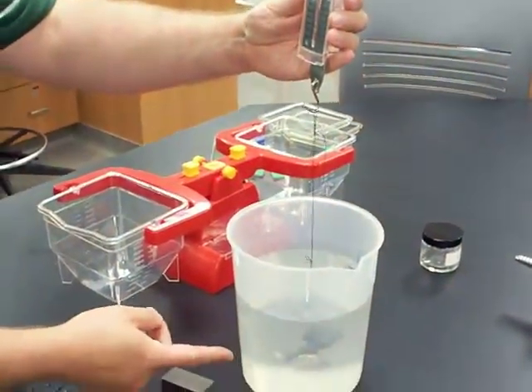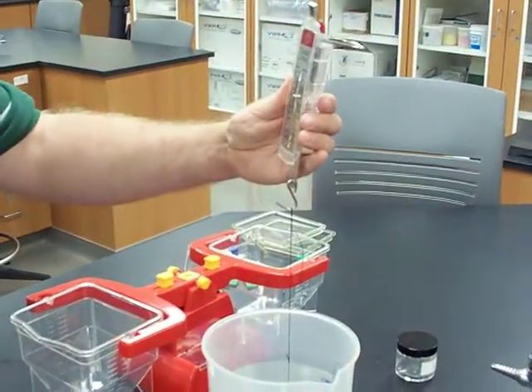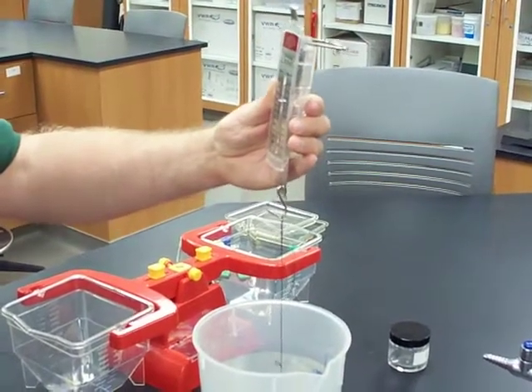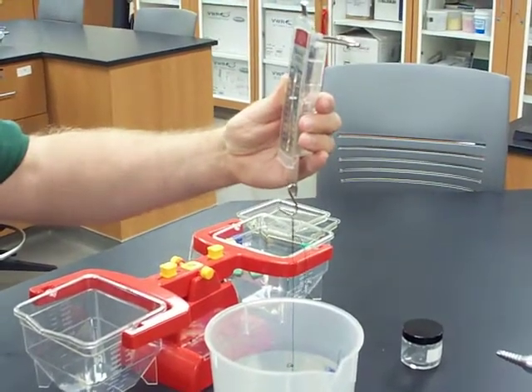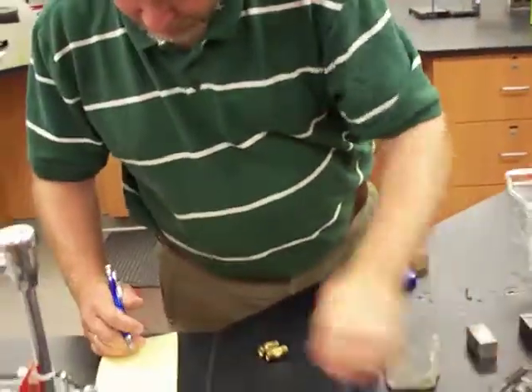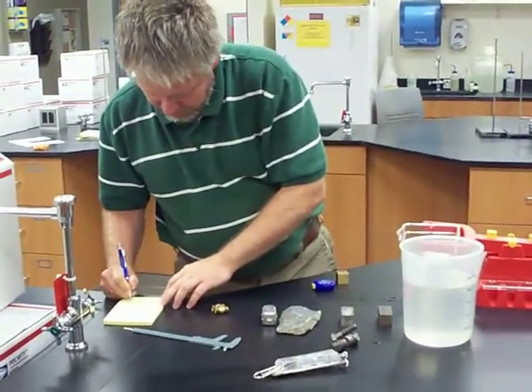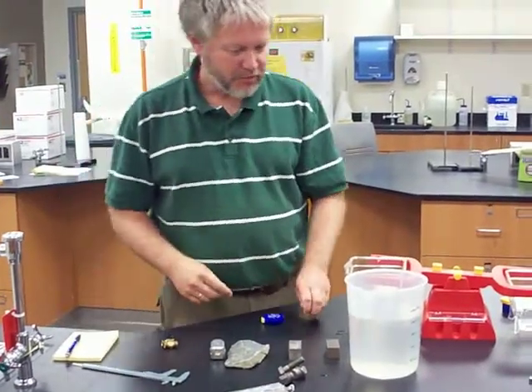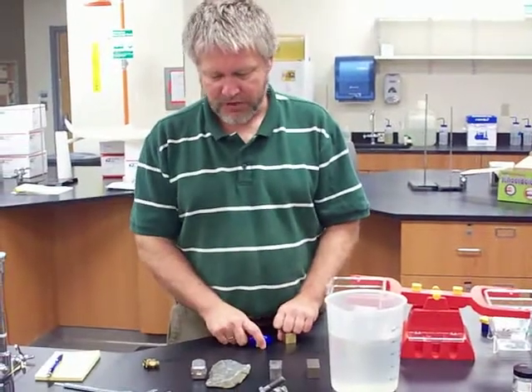I have to make sure that it doesn't touch the bottom and that it's totally immersed in water, and I'm measuring 145 plus minus 3 grams, because I cannot measure any more accurately. Okay, and those are the measurements, and then I'm going to do the calculations for the density.